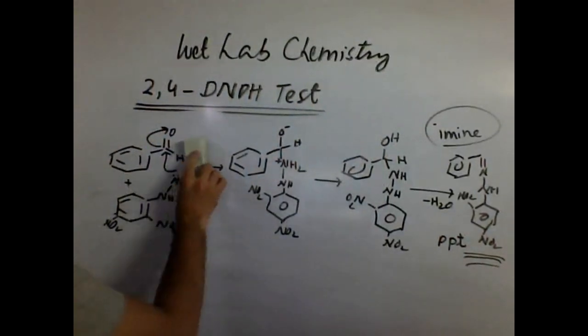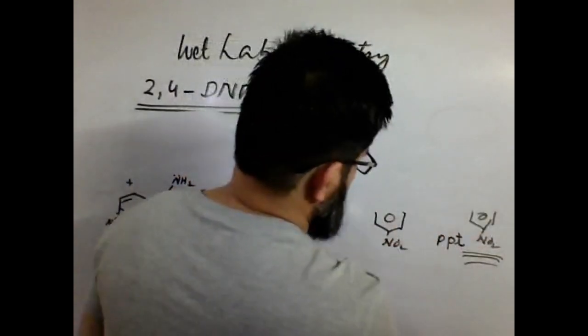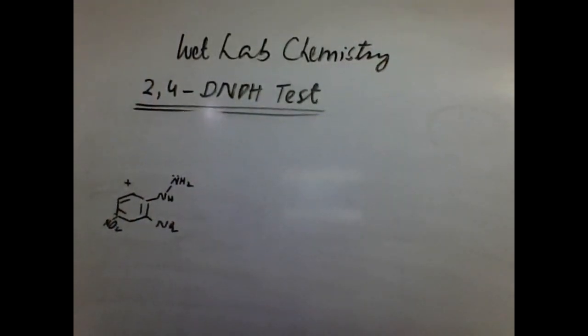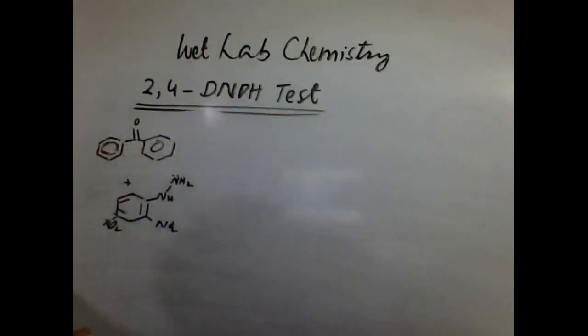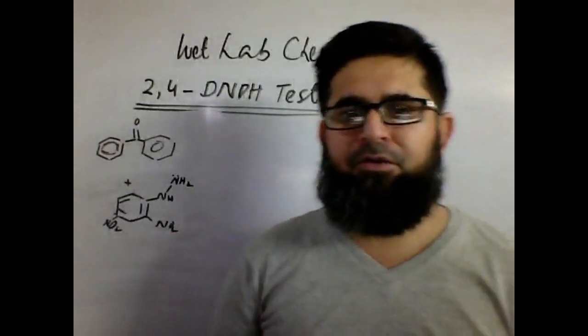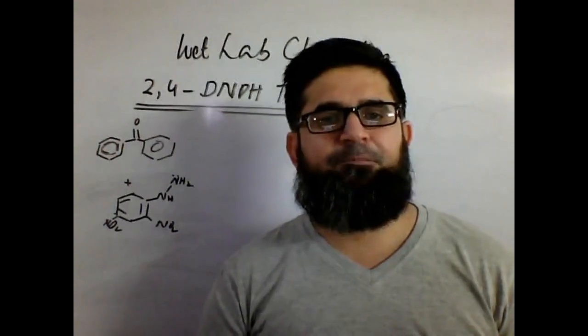Let's say if you have a starting ketone, let's say we have this sort of a body, very famous, easily available in our labs, that is called benzophenone. Benzophenone, we often give this body to you as an unknown organic compound and we ask you to identify this one. So it's a benzophenone.